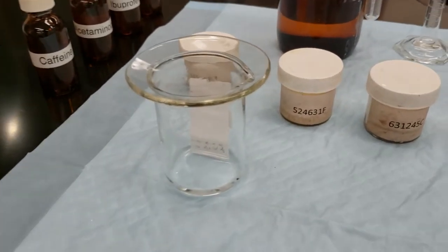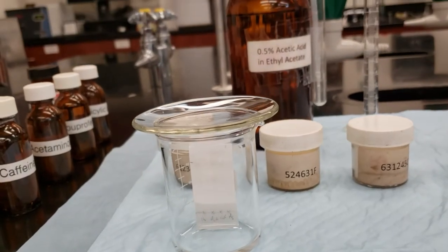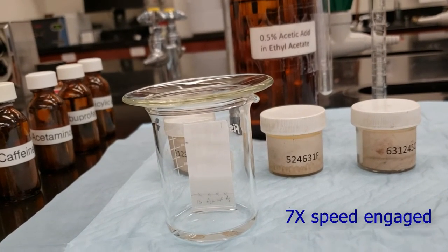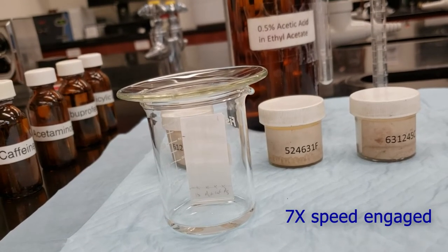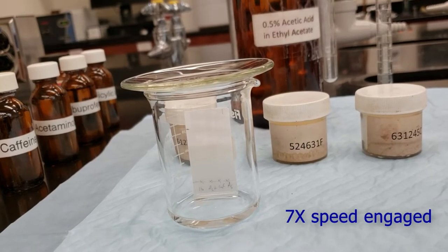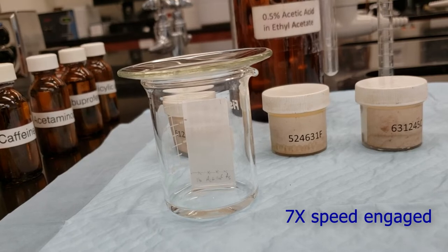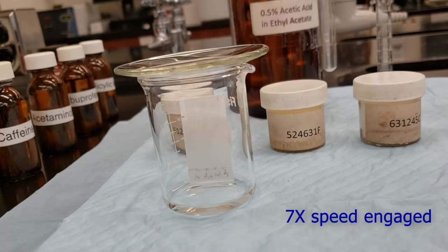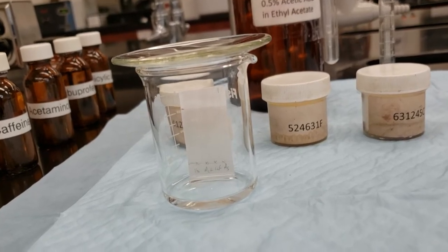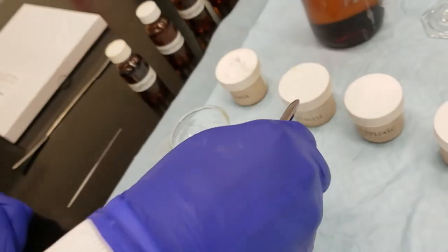I'm going to go ahead and put my watch glass on top to hold that vapor in. And we're going to watch the solvent make its way up the plate. Once it reaches our solvent line at the top, 1 centimeter from the top of the plate, we'll pull it out, mark that solvent line, and visualize our results using our UV lamp. All right, our solvent front has reached our mark. So we're going to go ahead and take our plate out of the solution, out of the developing chamber.